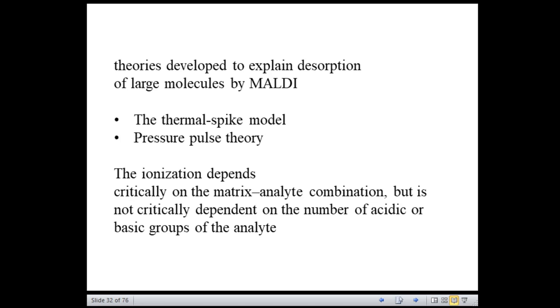So this refers to the thermal spike model. Heat spike. That means the heat is transferred to the matrix. The matrix in turn transfers the energy to the analyte. That causes internal vibration of the analyte molecule and the desorption happens.